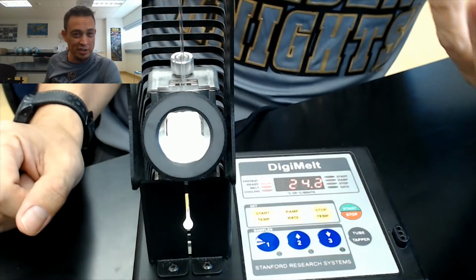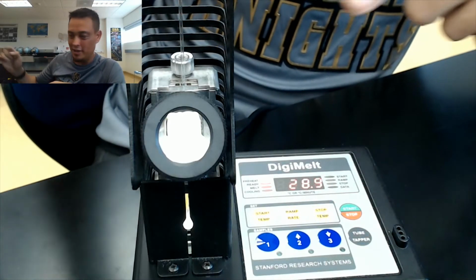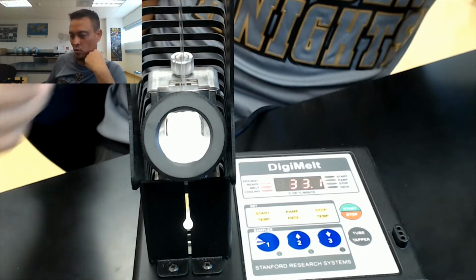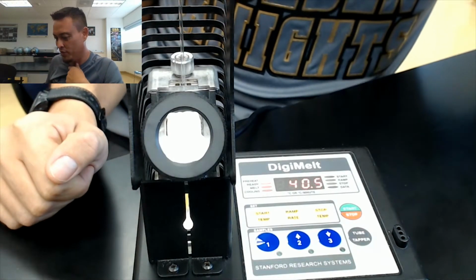And you could potentially do this. I should have done this the other way now that I think about it. But typically you want to go ahead and set this first, and then you want to go ahead and do your sample. So while it's heating up and getting ready, you can do your sample prep, save time, work efficiently.